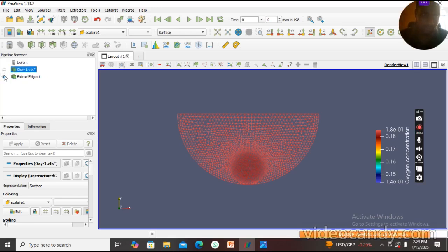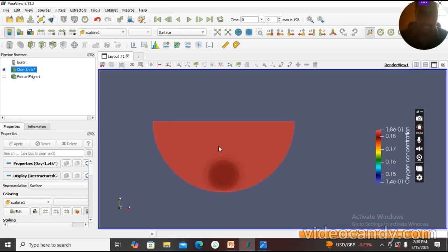And I can go back to my thing here. Let me try to make some animation. How do I save?